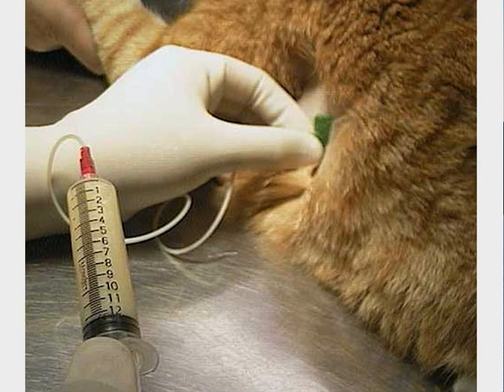Effusion is usually defined as an accumulation of fluid. It can be an accumulation of normal fluid or it can be an accumulation of abnormal fluid. And one of the fluid analyses that you guys have been doing all along and you're familiar with is urine. So we'll use the beginning of doing urine to help us with effusion cytology.